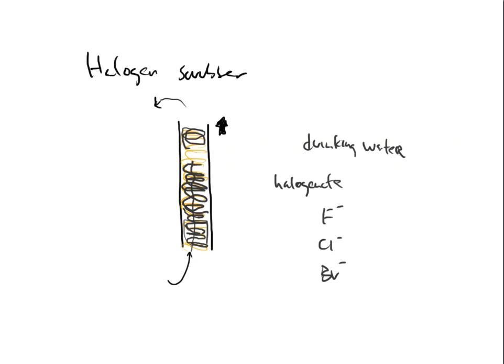As far as the chemical processing is concerned, think about some of those. We said that we could use this instrument to test for maybe hydrochloric acid impurity. Hydrochloric acid, I see chlorine, HCl, hydrobromic acid, HBr, hydrofluoric acid, HF. So of course, all of those will also be involved, and that's something that I have to pay special consideration to.